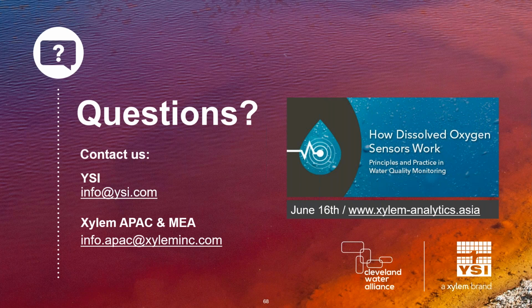However, the difference between a 2 and 3 point calibration is very small compared to doing a 1 point calibration. So as long as you're doing a 2 or 3 point calibration, I would not scoff at either one of those. Those are both good choices.